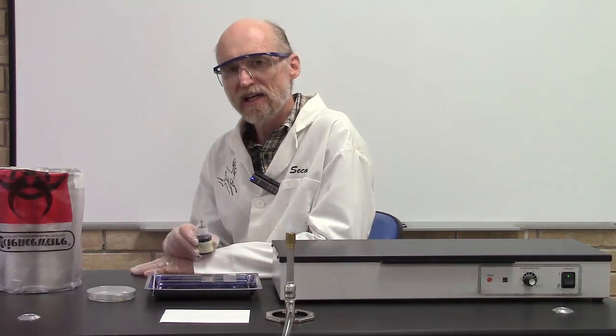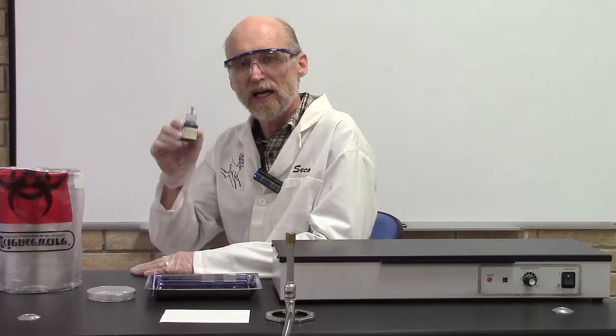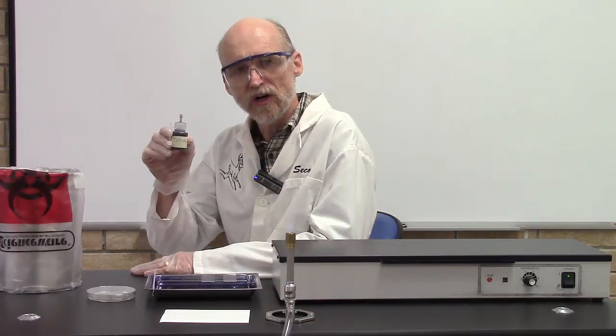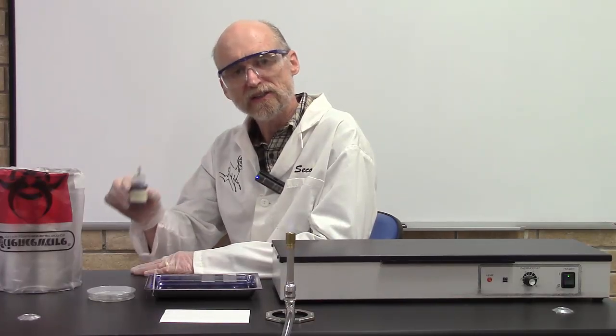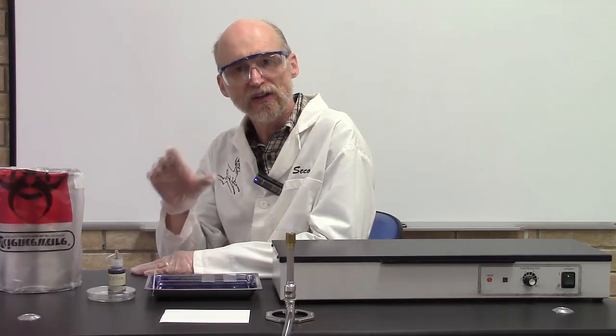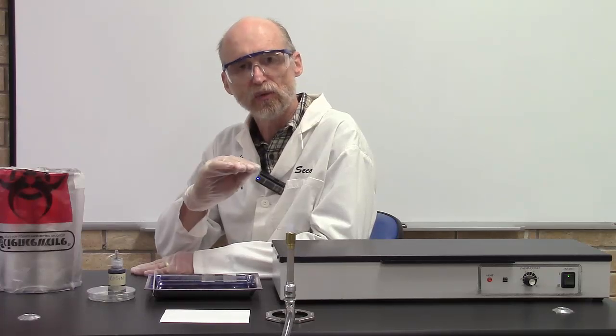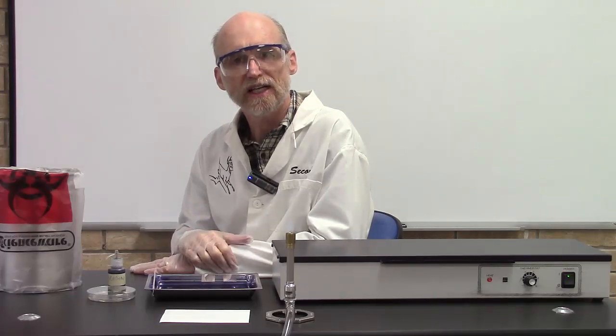The reason we call it the negative stain technique is because we're applying a stain that carries a negative charge. You'll recall the bacterial cells have a negative charge too. So the cells actually repel the stain. We're really staining the background. What you get is a white cell against a dark background. You get really nice contrast. Let's look at the materials you're going to need to do this technique.